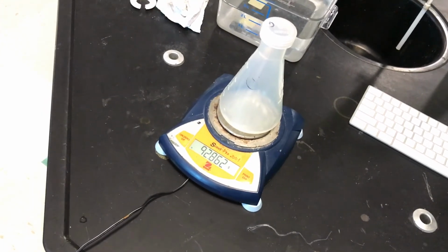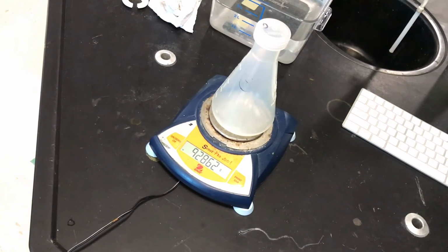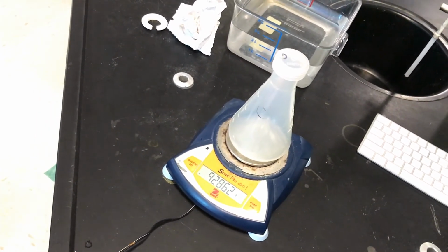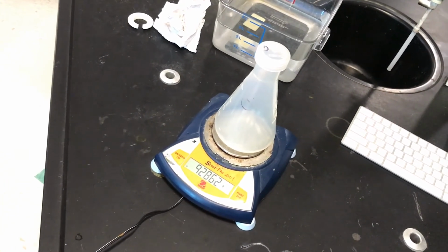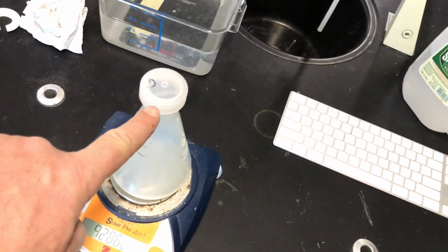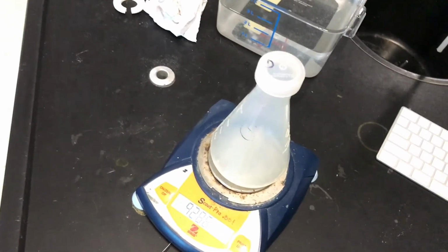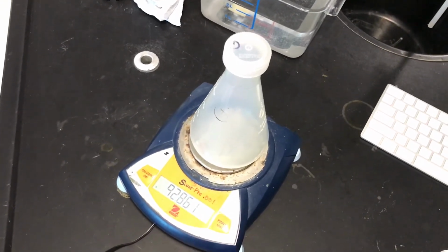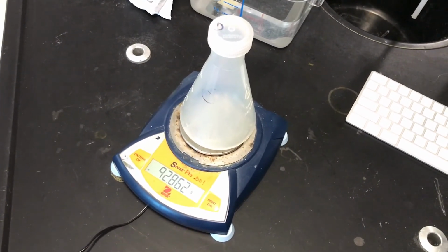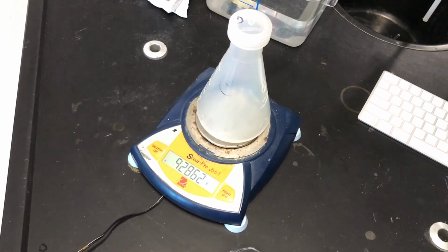Now what you can do now, volume of D is 516 milliliters. Somebody filled this up with water to the tippy top, measured it with a graduated cylinder, and found that this flask has 516 milliliters. What's that in liters? 0.516 liters.